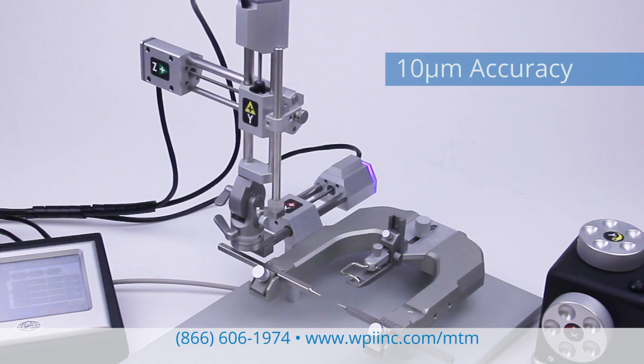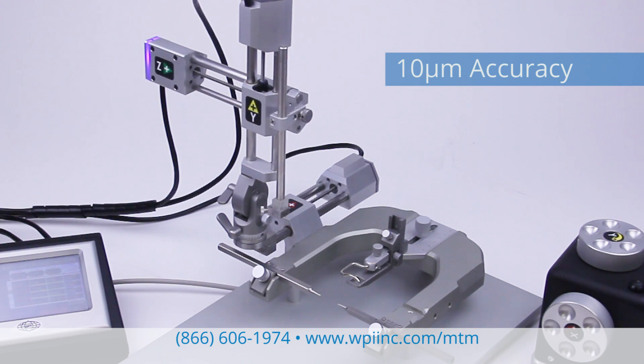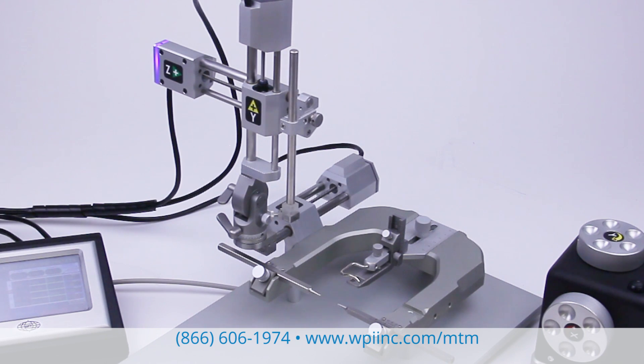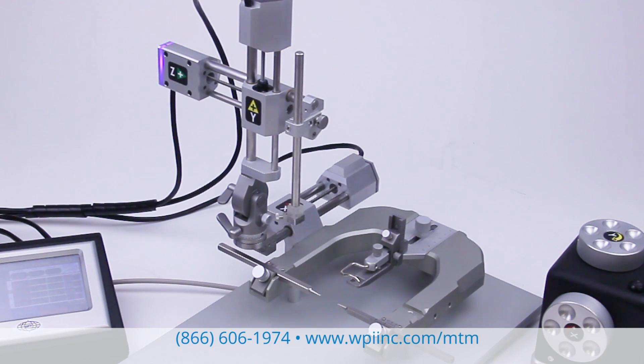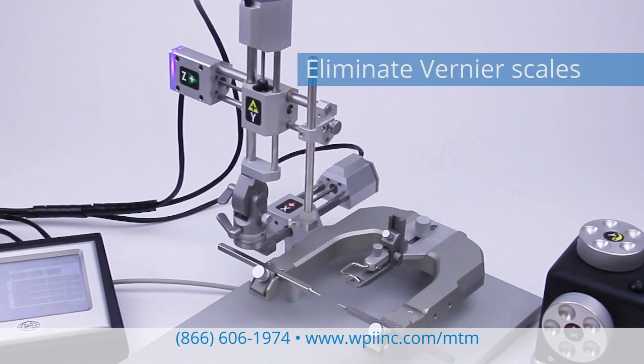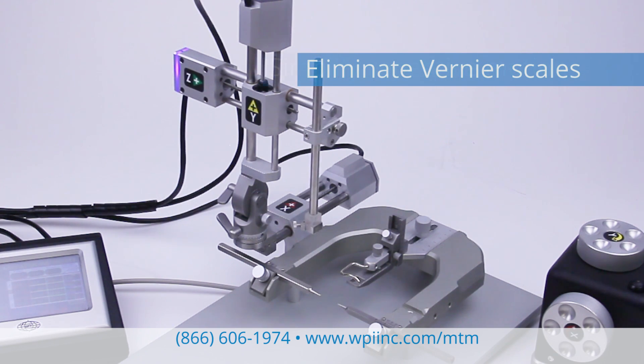High-resolution stepper motors ensure the accuracy of the MTM3, which delivers submicron stepping resolution. The MTM3 controller performs all the necessary calculations and stores the calibration data. No more vernier scale reading errors.